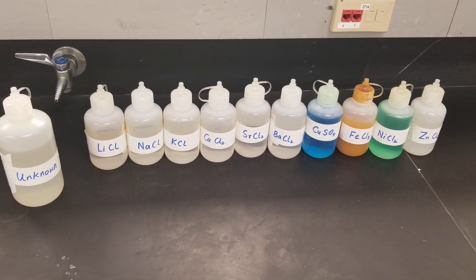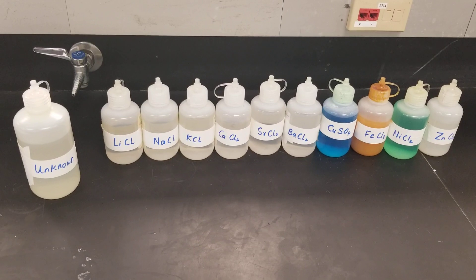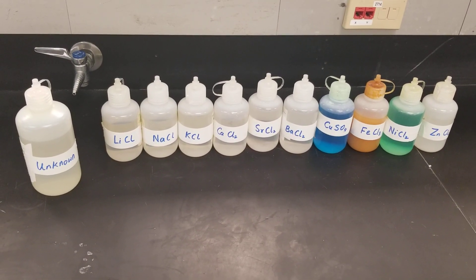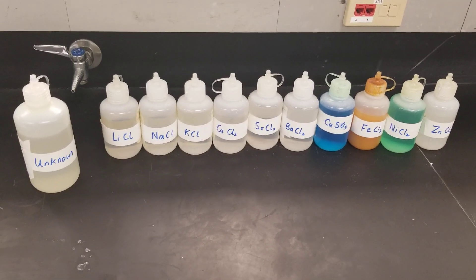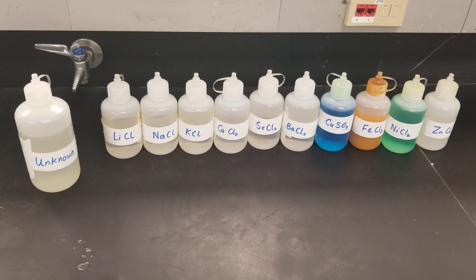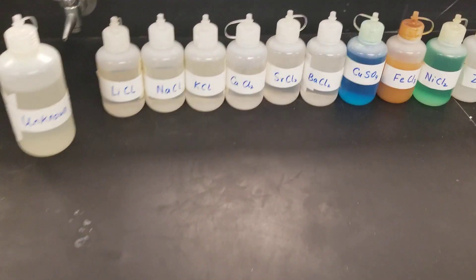This is the Chemical Reaction 3 lab. The purpose of this lab is to identify the metal by doing the flame test and precipitation reaction, and to identify the halide by the common halide test.